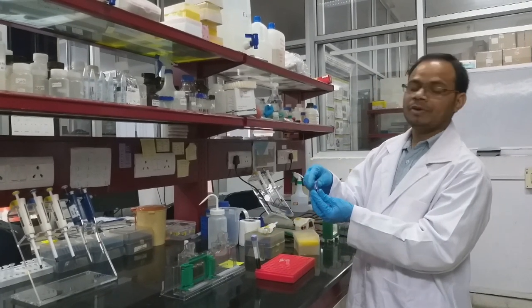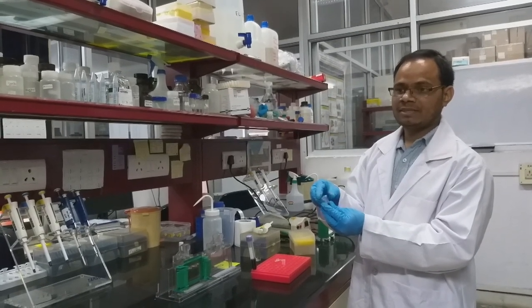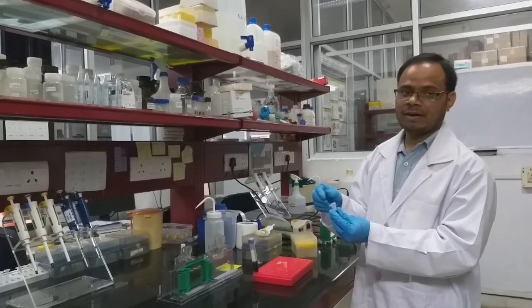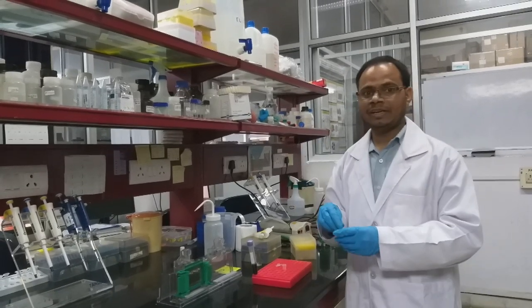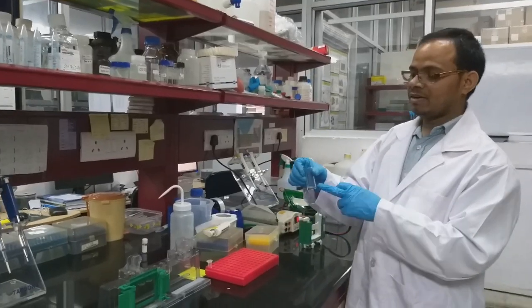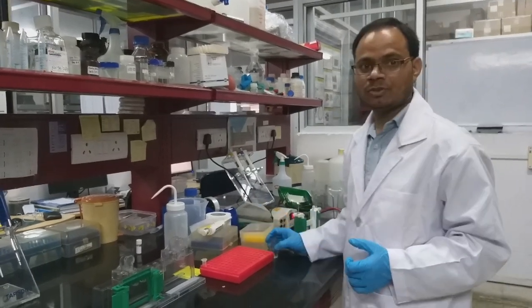Then we have to heat it for 3 minutes at 100 degrees Celsius, so that all the polypeptide chains, dimers, or any multimers present will break down and we can see a nice band. So I am going to heat this at 100 degrees Celsius for 3 minutes. This is the remaining stacking gel solution. We can see it is solidified, so that means the stacking gel also got solidified.